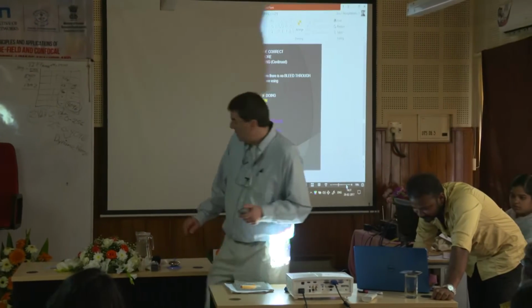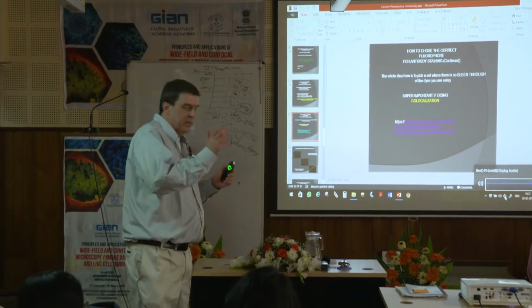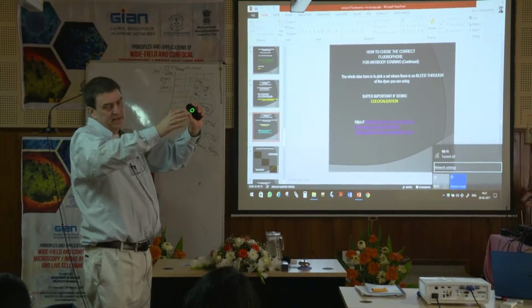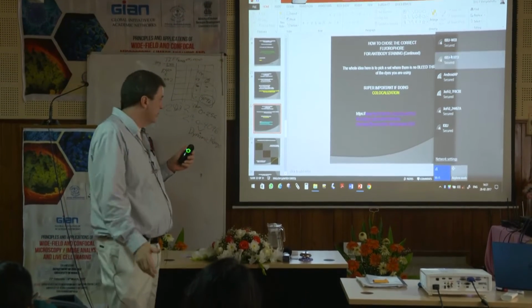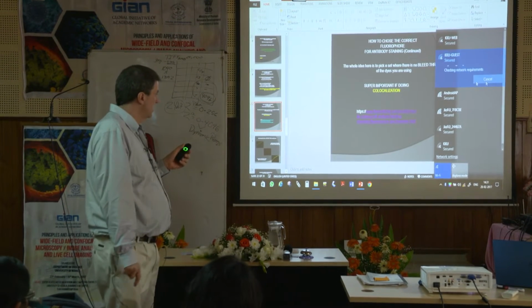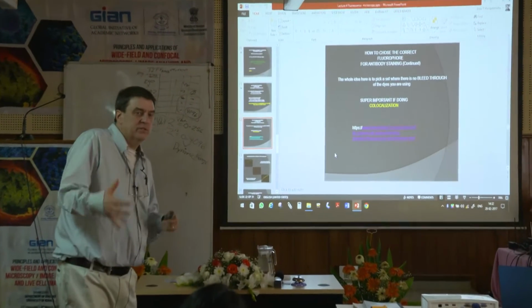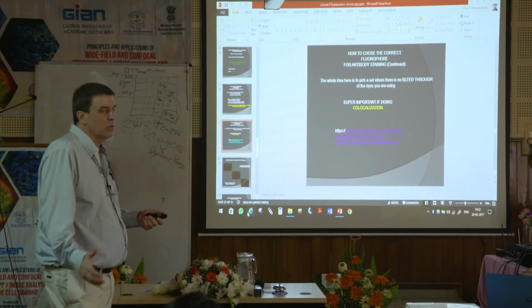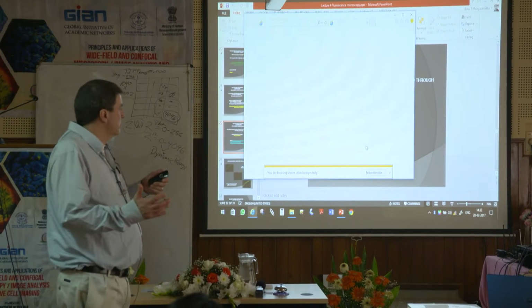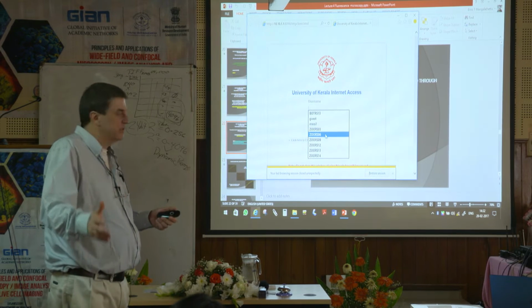But what it is, it's basically a website where I can punch in Alexa 488, a different Alexa, another dye, and I can see the spectrums. So I can determine, hey, are they going to overlap or aren't they? Like I said, I use it all the time because the people I work with who know what they're doing come over and say, hey, I want to do this. I want to use this color, this color, this color. Will it work? And we'll look it up first and determine, yeah, I've got the right filters. I don't think I'll get a bleed through, and I'll show you the problem with bleed through here in a minute.